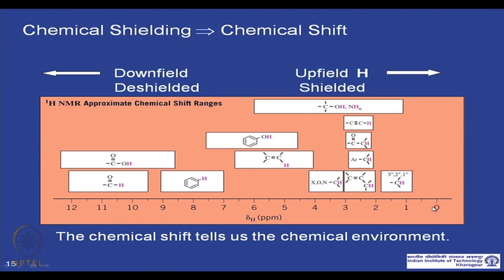So, if you compare different groups in a standard, like in case we are talking about the hydrogen atom, the proton. Now, these protons will have different chemical environments. So, they will experience a different external magnetic field, so their resonance energy will be different. Though the differences are very small, they can be resolved, and so they can be put on a scale.